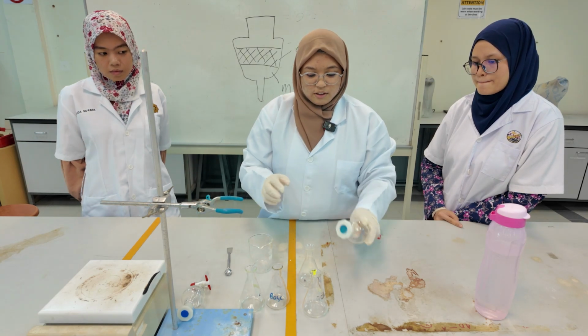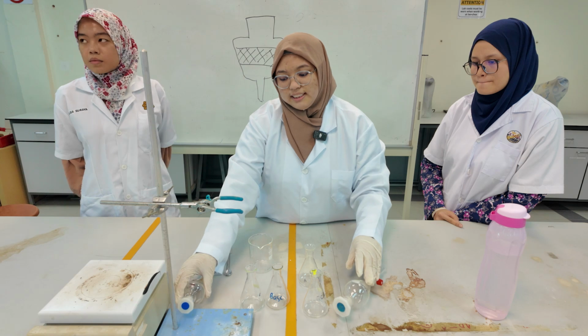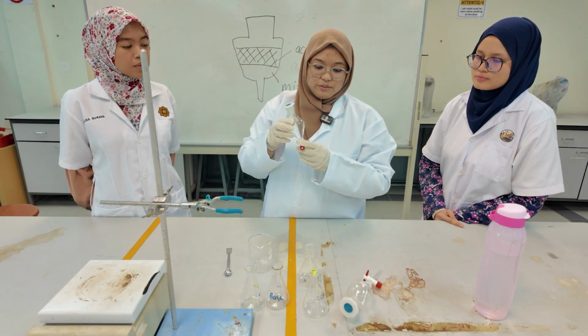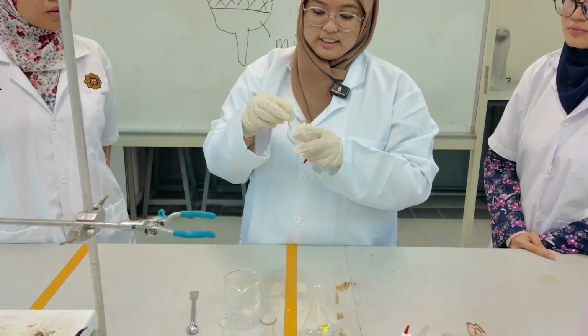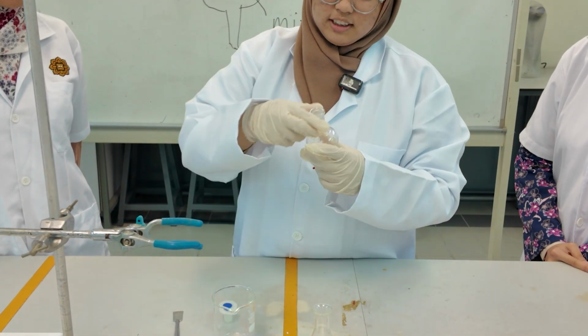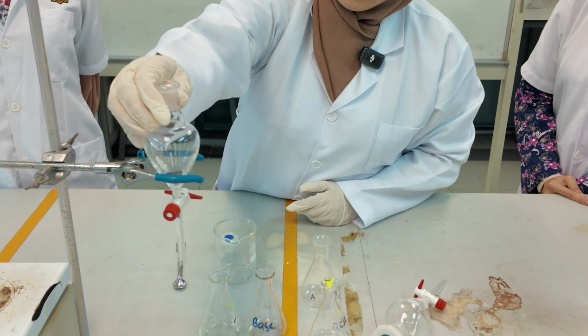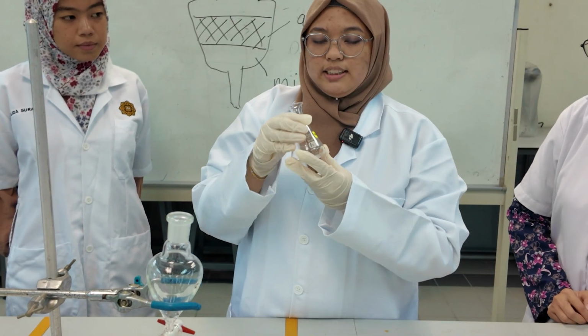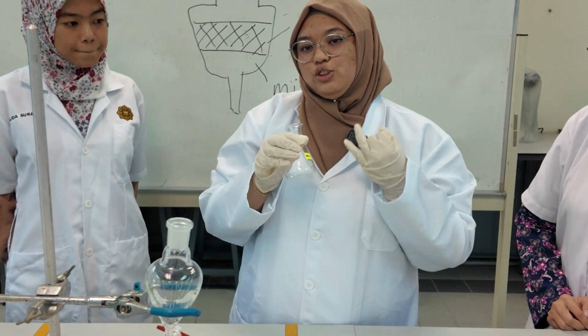All right, moving on, we'll be doing the base extraction. To prevent contamination, we'll be using a new funnel. Just like the acid extraction just now, we take the mixture, which now only contains base and neutral compounds.